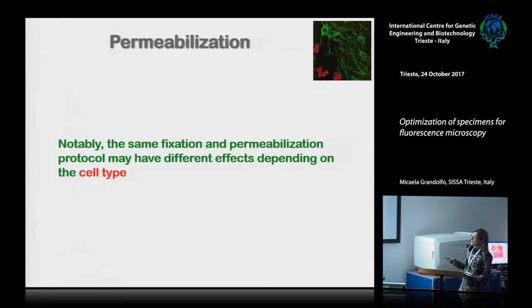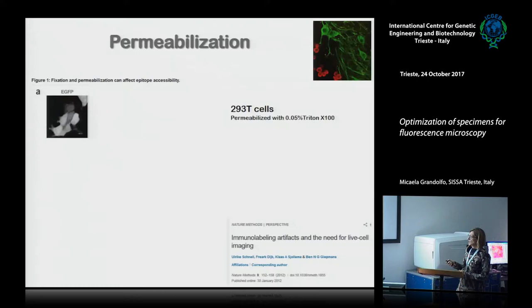Remember that the same fixation, and in this case the same permeabilization, may have very, dramatically different effects on different cell types. And I can show you some examples. These examples are taken from this paper in Nature Methods, and I suggest you read it because it is inspiring. And I would like to show just two very, very simple examples.